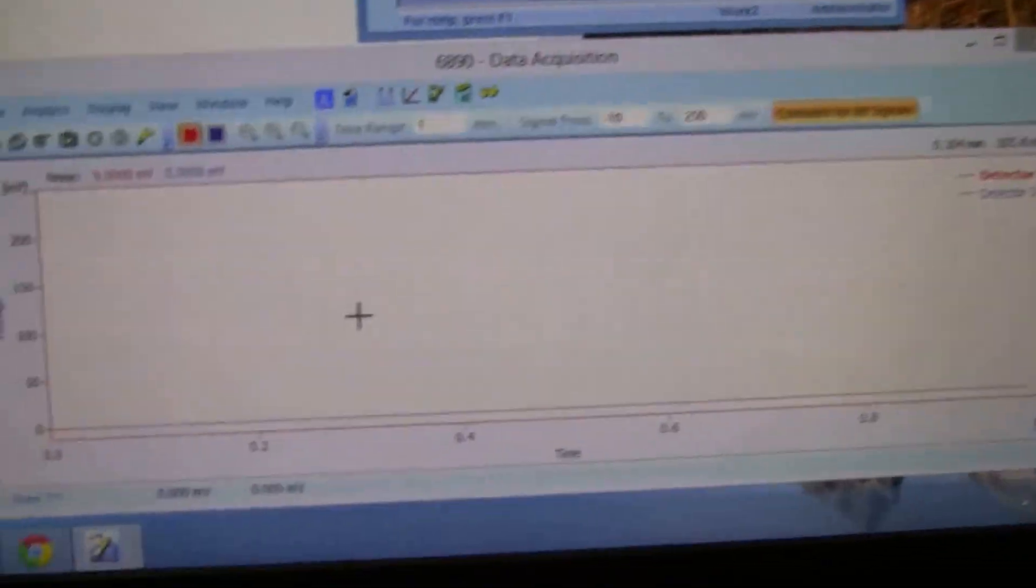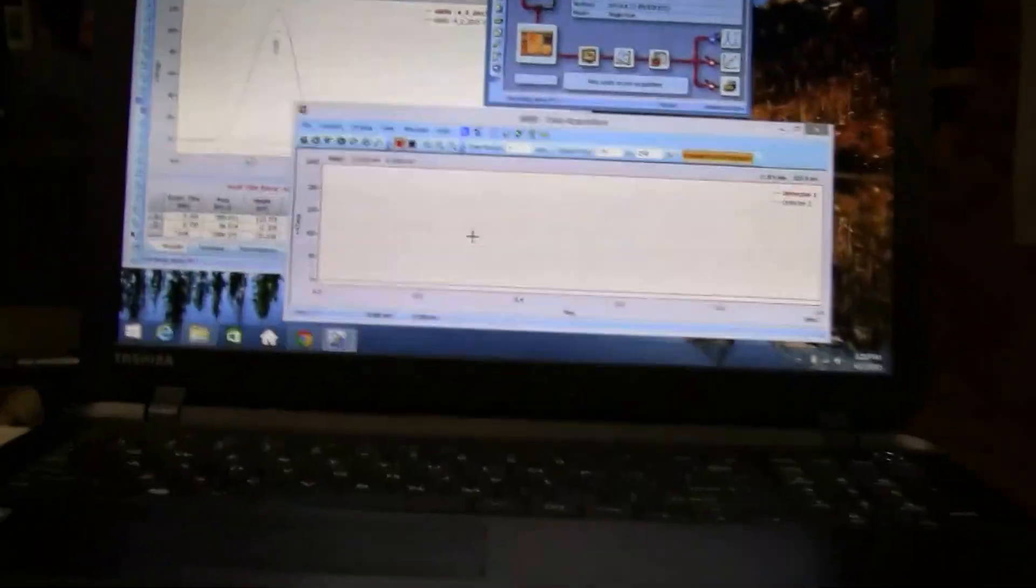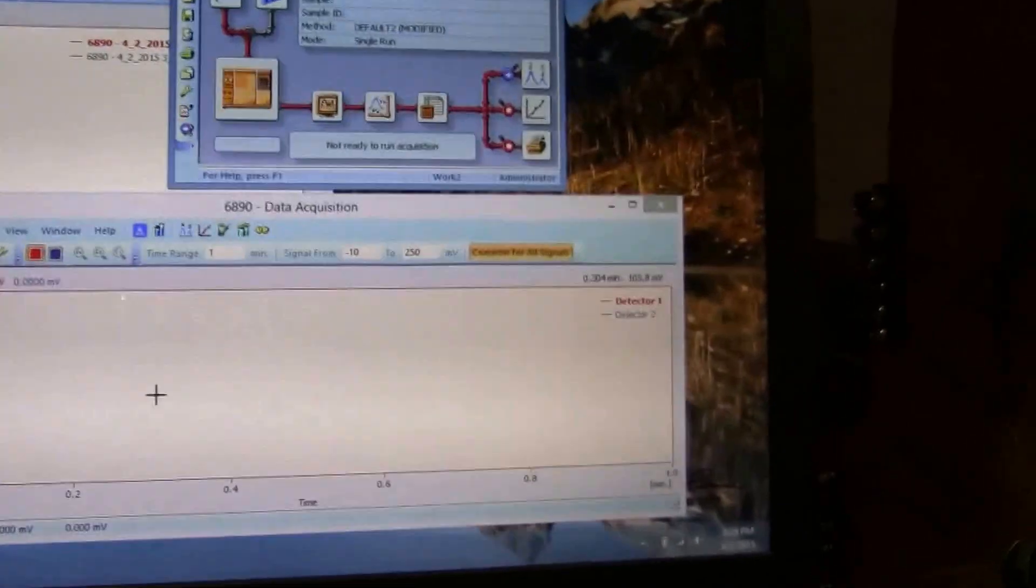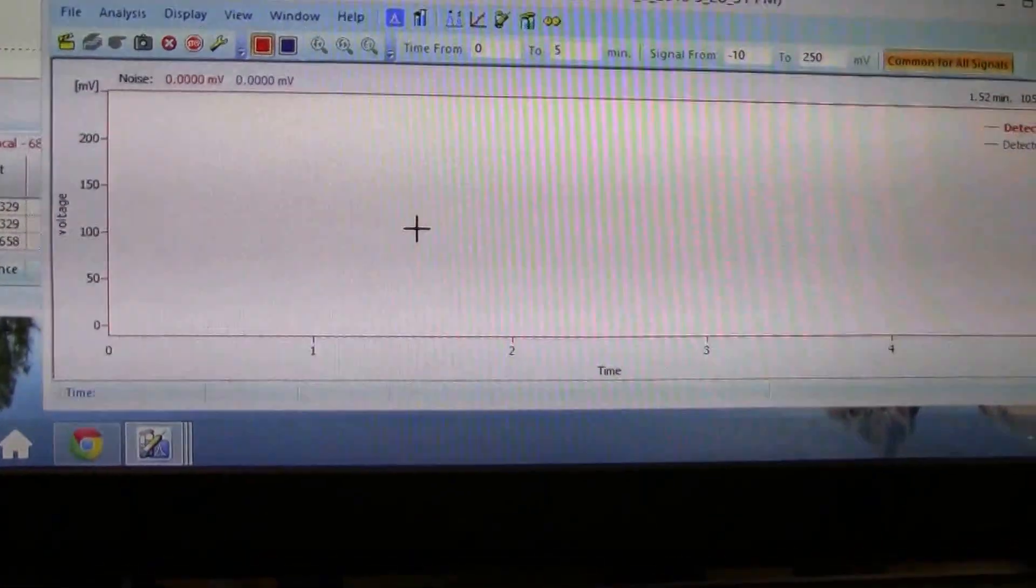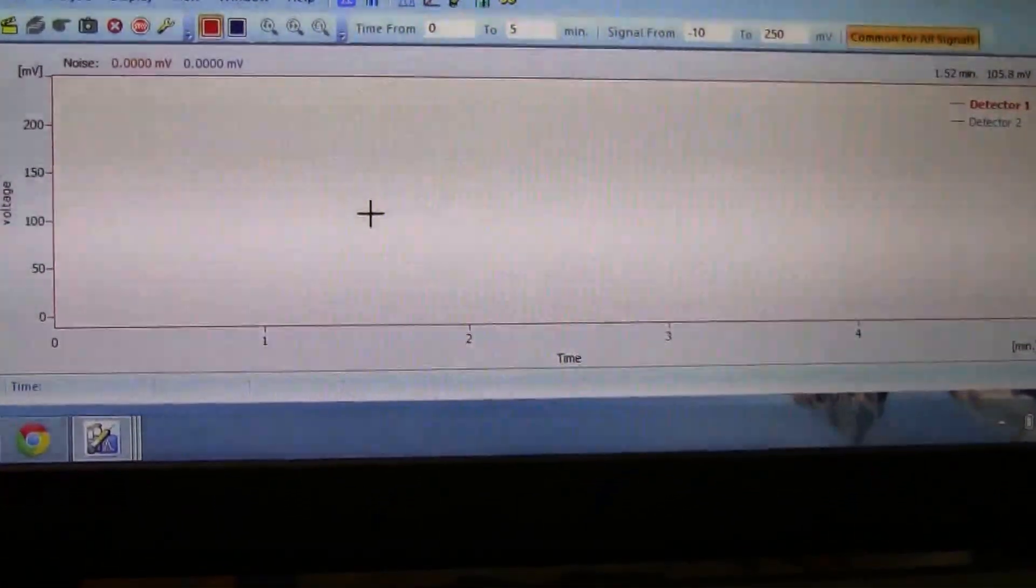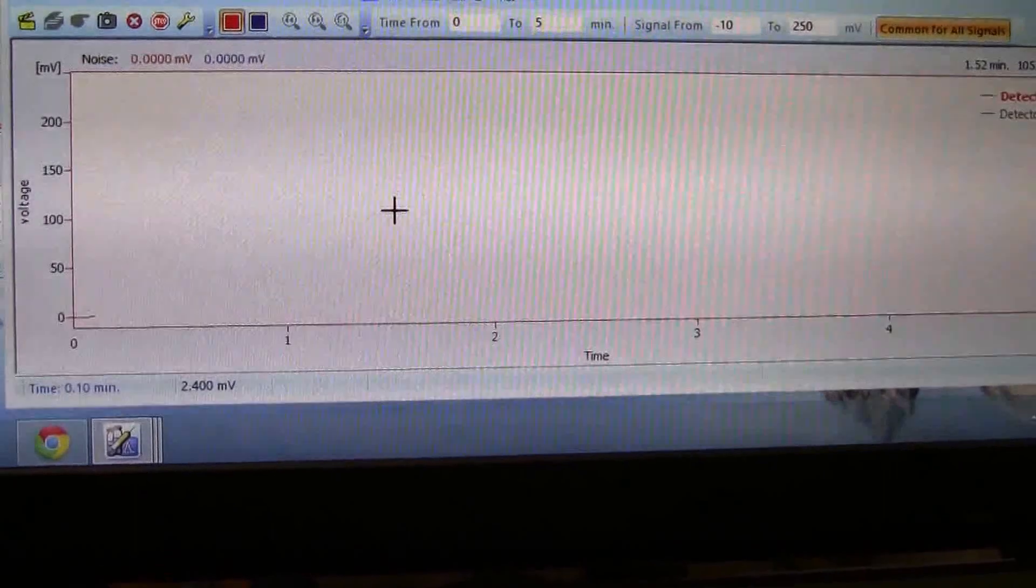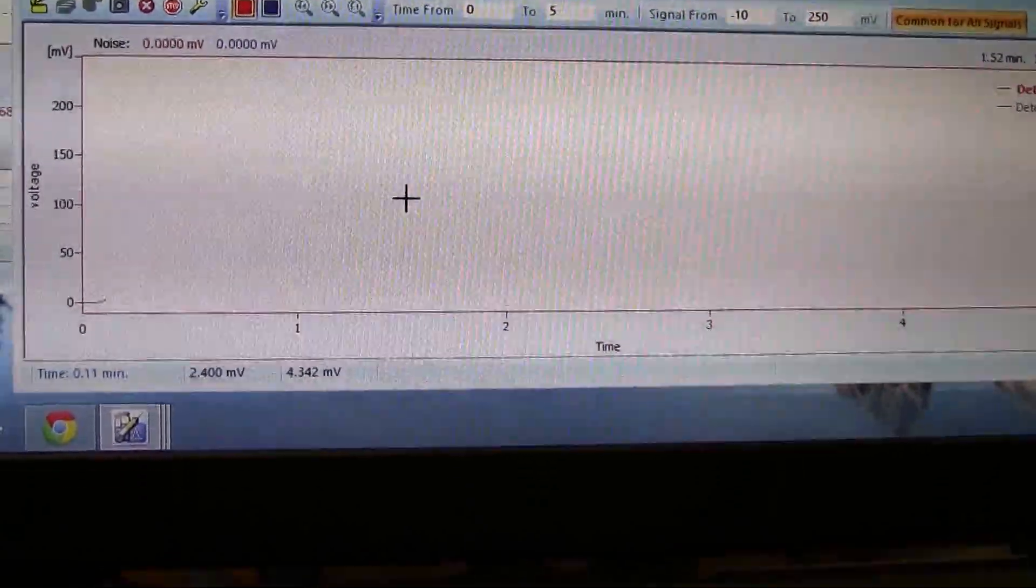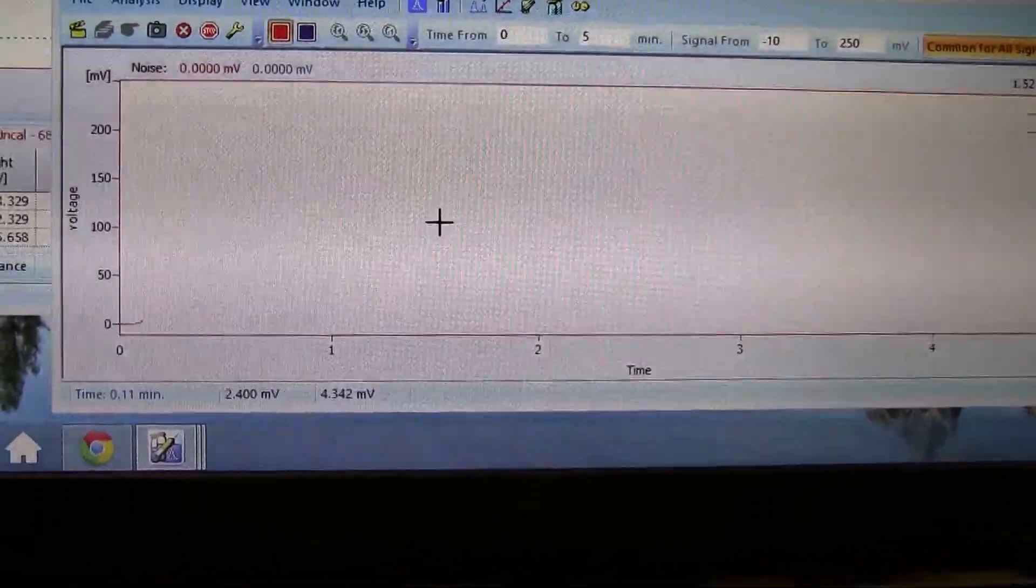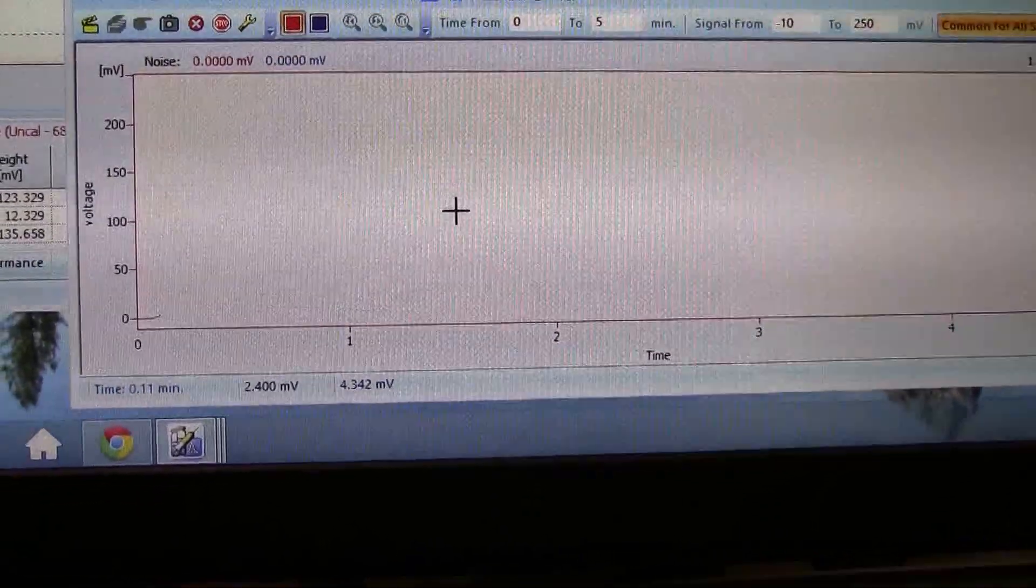Let's see if I can send a signal quickly. I'm going to hit start as if I were to inject the sample. Now we can see the peak starting to form.